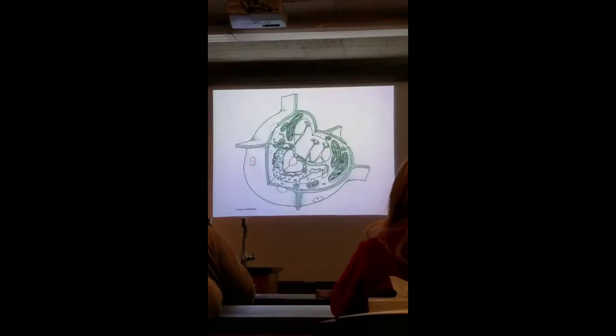There is a pathway connecting two adjacent cells. What is this thing called? Plasmodesmata. These little pores that we see here. There's one right here, cut through. Question. What was the last one? The plasmodesmata.